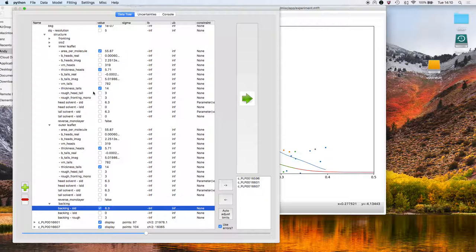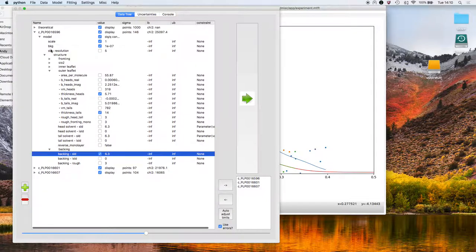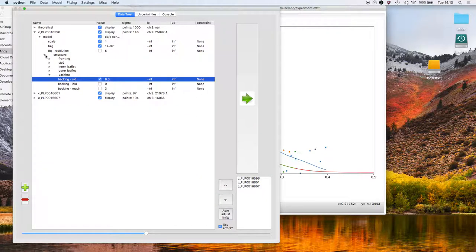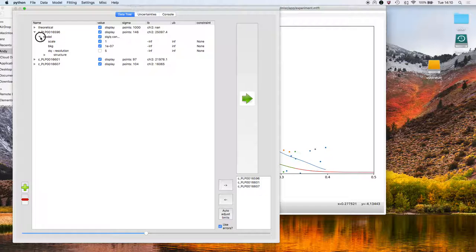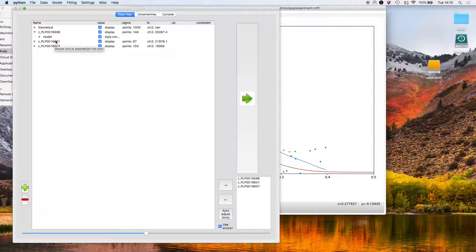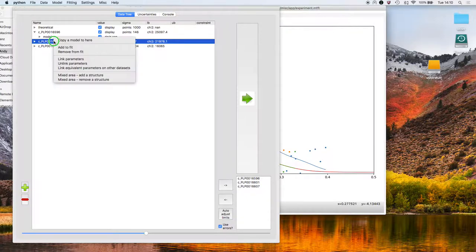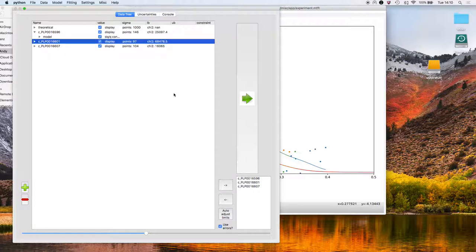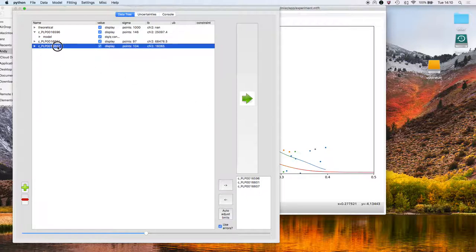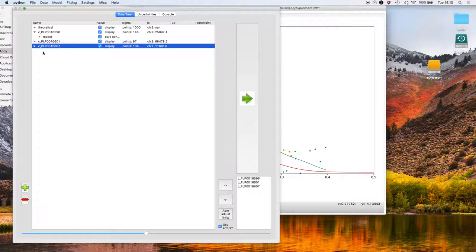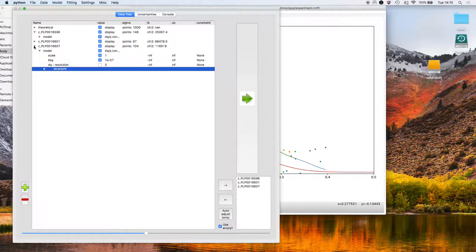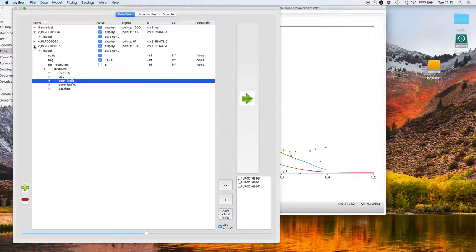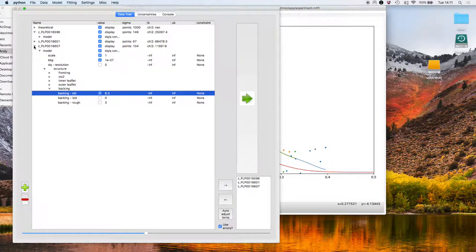Once we've done this amount of initialization, what I'm going to do is I'm going to copy the model that we've got for this D2O dataset into the other contrasts. So select this one, copy a model to here. What do I want to copy? I'm going to copy the D2O one. I'm going to do the same for the last contrast. And now if I go into those structures, you can see that we're replicating the structure of the first contrast that we started setting up.